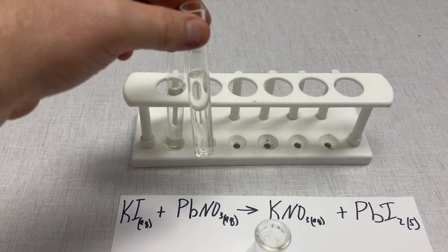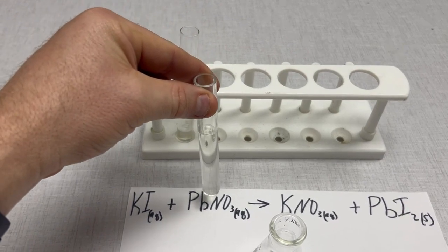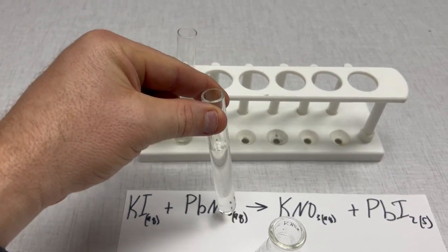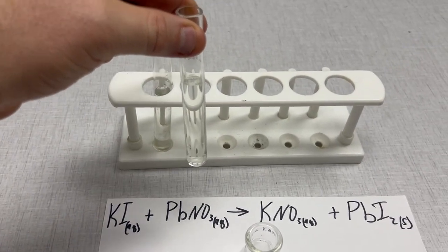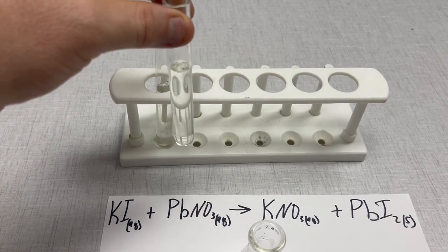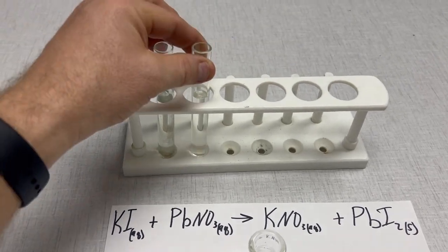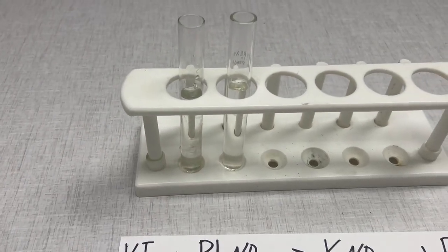Then we have lead nitrate, which is the Pb(NO3)2. Also we see the AQ, so we know that this is also dissolved into solution. So both of these start off as powders and I mix them with water and we got these two clear solutions.